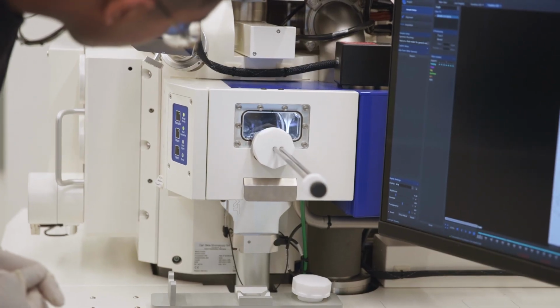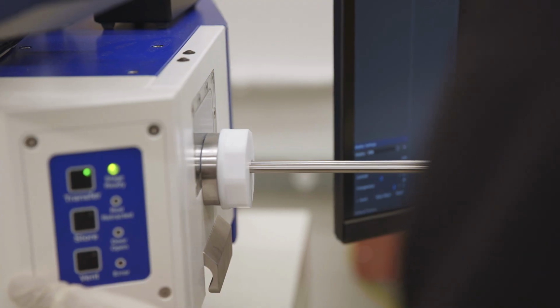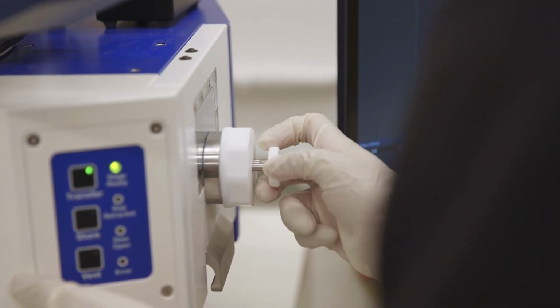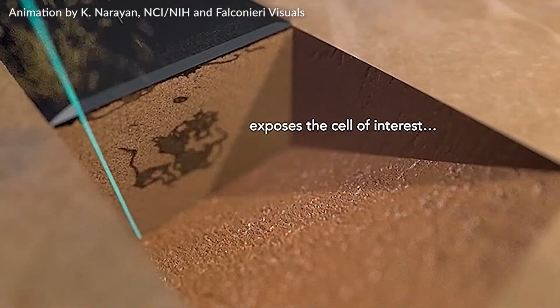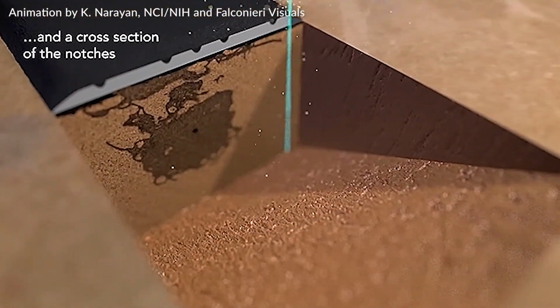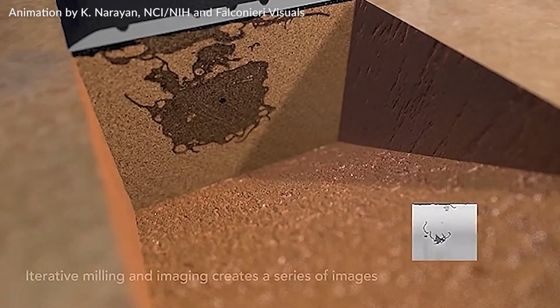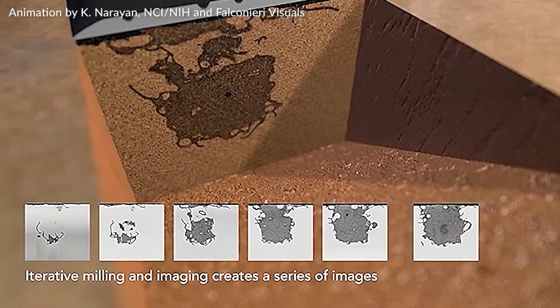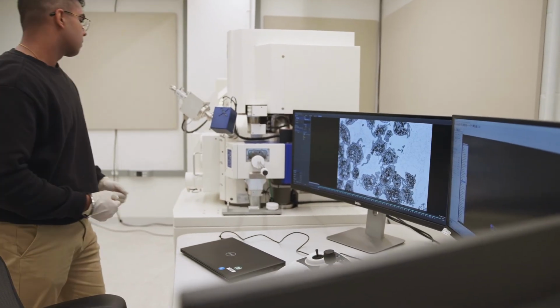Right now, I am looking at platelet morphology for COVID-19 patients. And so that requires me to work on a focused ion beam scanning electron microscope, which is different because I use ions to slice off a sample and use an SEM to image, while traditional SEMs use an actual knife. The beauty of this device is I get higher resolution images compared to other modalities of SEM. When I look at the FIB-SEM, I can get a Z resolution of close to 3 to 5 nanometers.